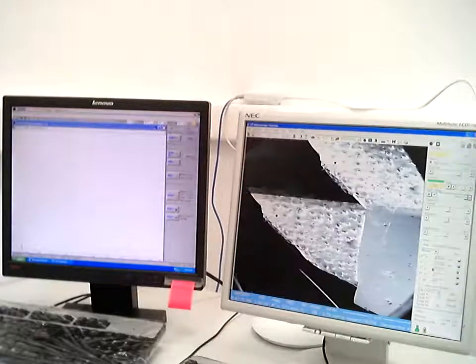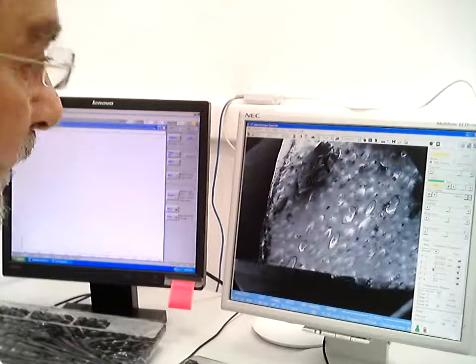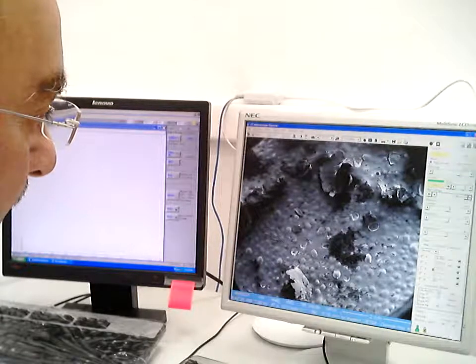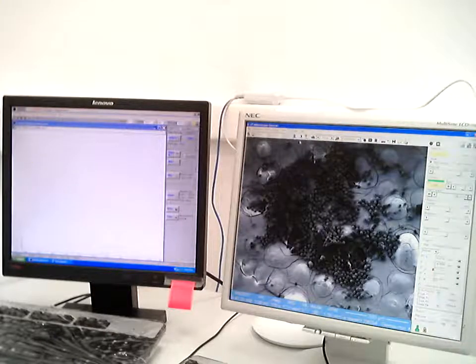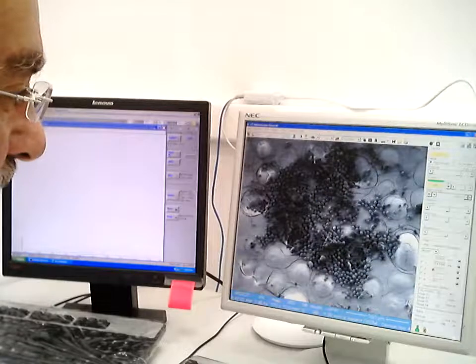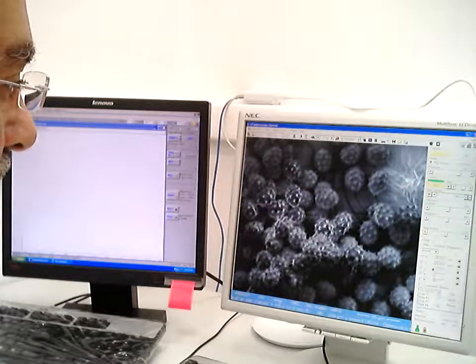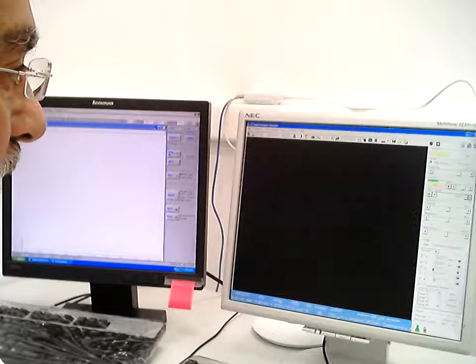The number 3 was an interesting one. It was actually material that could have been collected from a shoe. There's an interesting part here. This is a really interesting thing. So what is this? Have you ever seen anything like that? It's actually pollen. And it's pollen from a particular type of flower. Look at that over here. It's a particular type of flower.